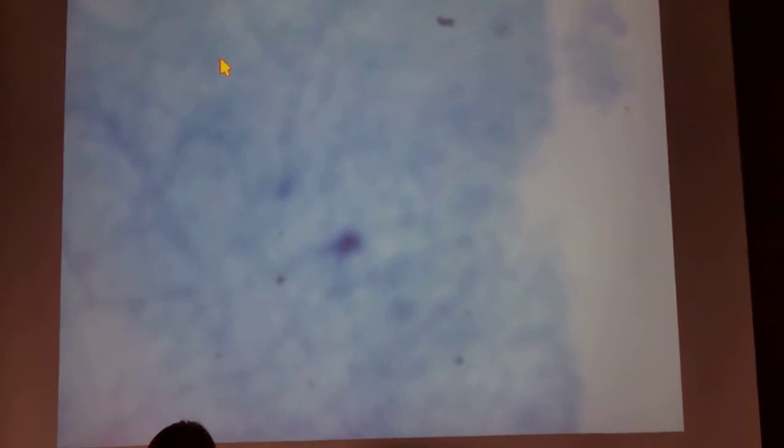We don't have one that has it all. Okay, and usually what they do is they just pull a section of muscle. Said that that's the exact same thing you just looked up. Hold on. Oh no.